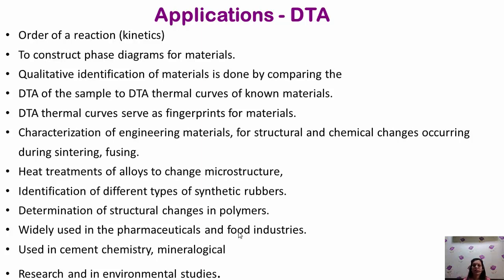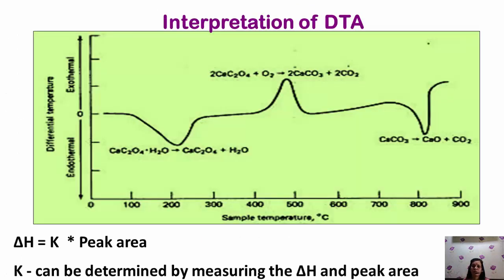This is the application you can use in the pharmaceutical and food industry, where you want to maintain the taste and color of the product at the drying temperature. So you have to apply the drying temperature in such a way that you maintain the taste and color in the case of the food industry. Also in the chemical and cement industry, and in research and environmental studies.